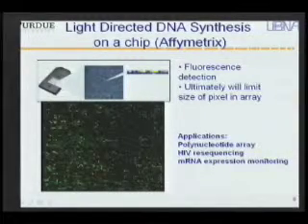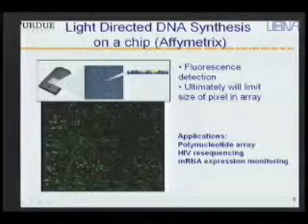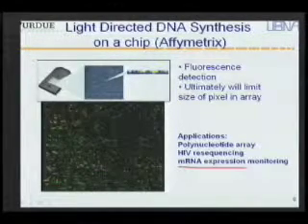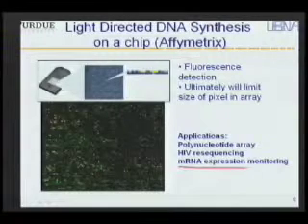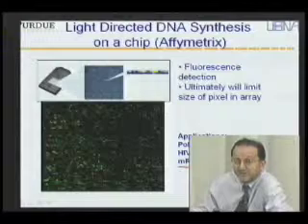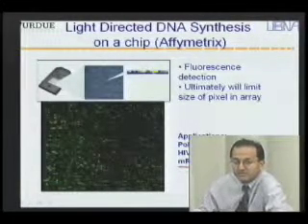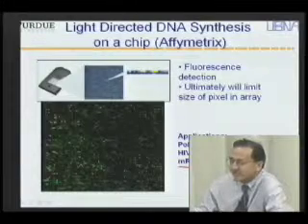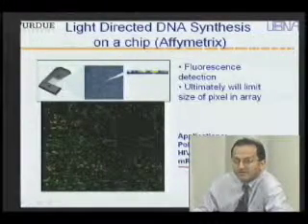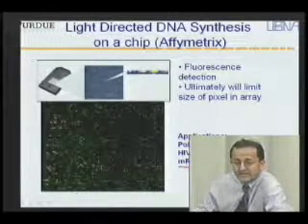Here, I just want to make the point, remember that not all DNA reactions have to be perfectly stringent. Two strands can bind to each other even if there are some mismatches, right? So that's exactly what this array does. It also extracts out the intensity of the signal, and the intensity would relate to the concentration of the molecules that are attached, and that gives you an indication whether you have full, stringent hybridization, or there are even some mismatches.